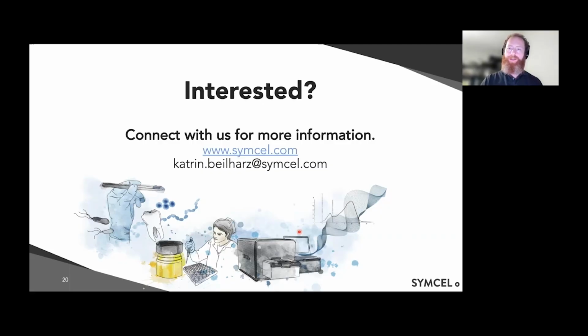To start with, and this is a question to you, Katrin, but it also might be for people in the audience, because I know we have a lot of experts in probiotics there: what are the probiotic products that could most benefit from this, meaning where the methods that are there now are a little bit lacking, or it might take too long, or it might be difficult if you're dealing with solid or opaque samples?